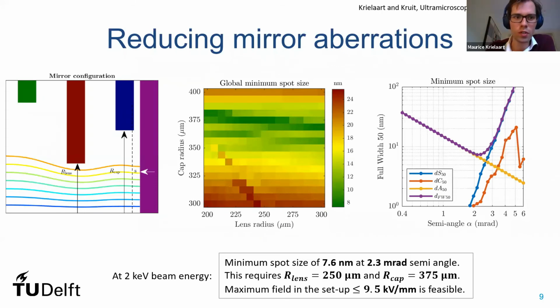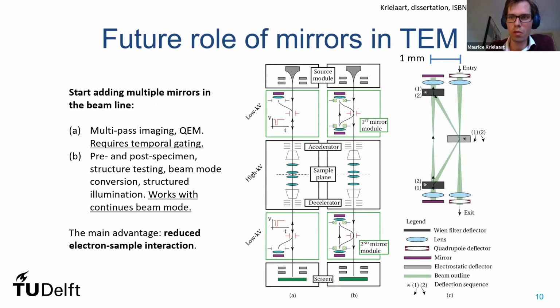We're now in a process of getting this mirror inside a scanning electron microscope, to do some experiments and see if we can actually also experimentally get these results, because this is all numerical work. That will take some more time, but before we get there, I think it would be nice to give you an overview of the main concepts that we're thinking about in the group, of what we might be able to do with these mirrors, given that you can pattern them any way you like. And admittedly, this is a very complicated slide, so please don't be discouraged if it is a bit fast.